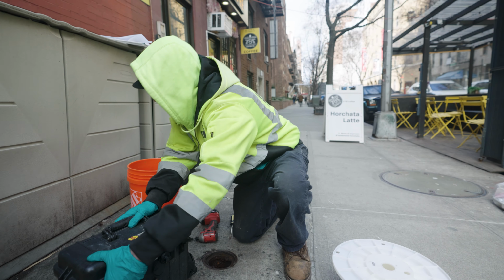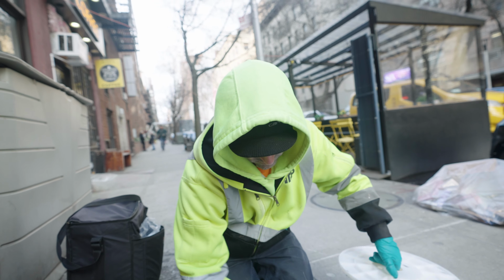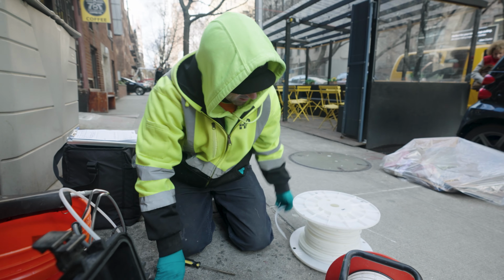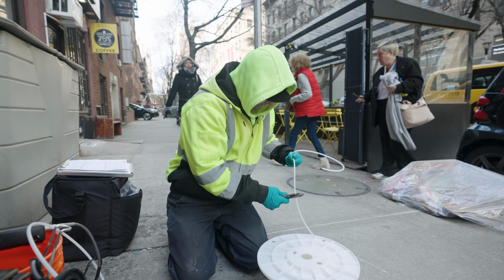Alright, just setting my tubing to the correct depth for this well, which will be mid-screen. Using high density tubing because we're sampling for PFAS. Cut our tubing, go through our silicone, coming back out from our pump, using our high density, go out into our low flow parameter meter.